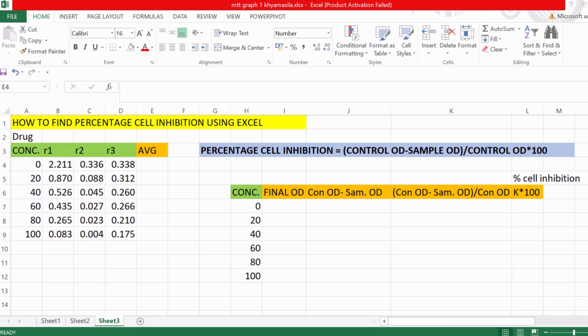Percentage cell inhibition is calculated when we do cytotoxic assays like MTT. In that assay we find the effectiveness of the drug on a sample — for example, a bacterial cell sample, mammalian cell sample, or cancer cells. When we want to see the efficacy of a particular drug on those cells, we need to find out the percentage cell inhibition, which shows us how toxic the drug is towards that cell.